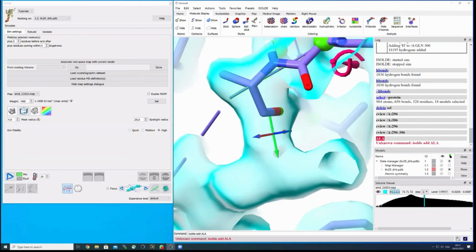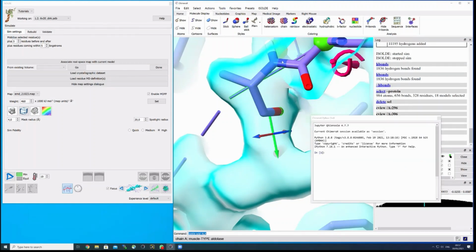So what is very cool about ChimeraX and ISOLDE in general, if you are as capable as Lux or Thomas or whoever else is in scripting, Maurice, for example, you can use basically a shell within ChimeraX. So you find this under Tools, General, Shell, and if you click on it, it will open a shell for you.